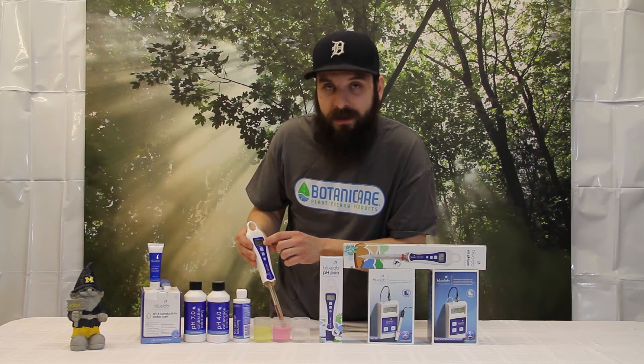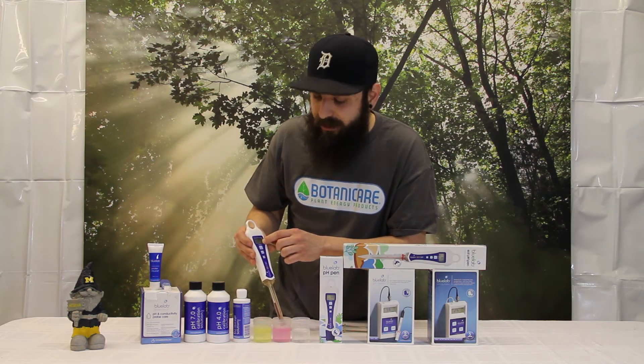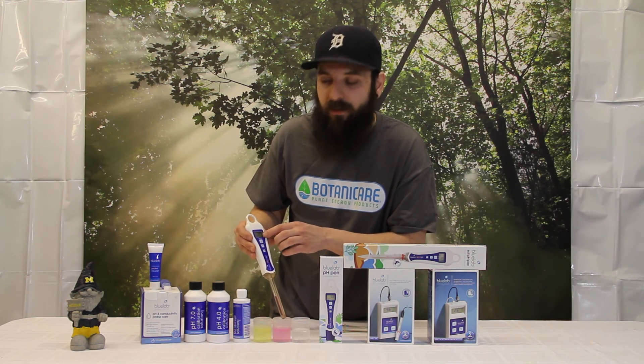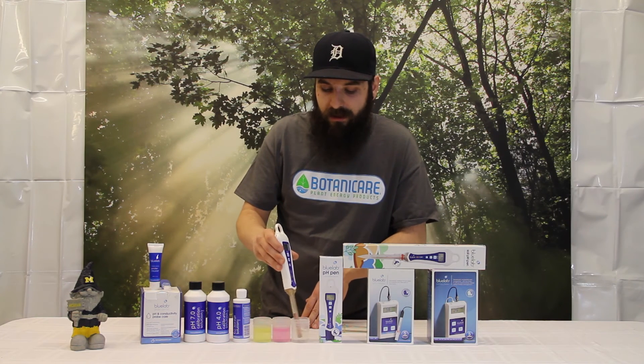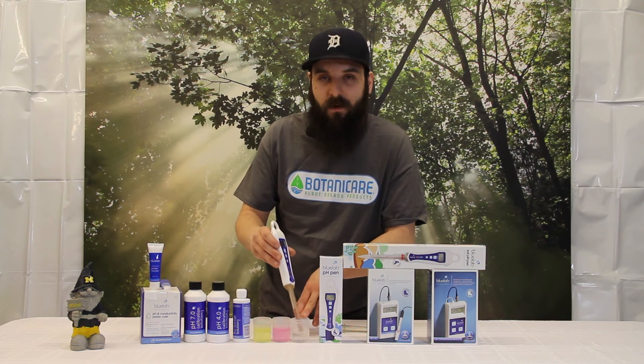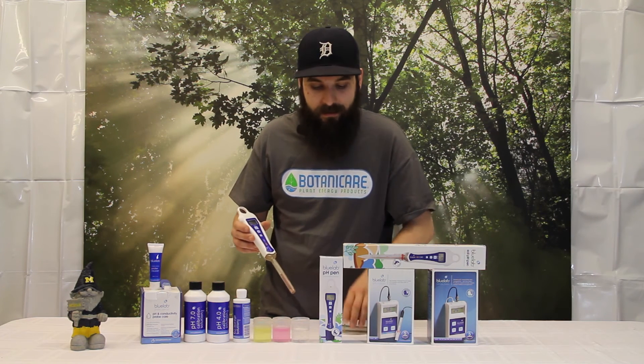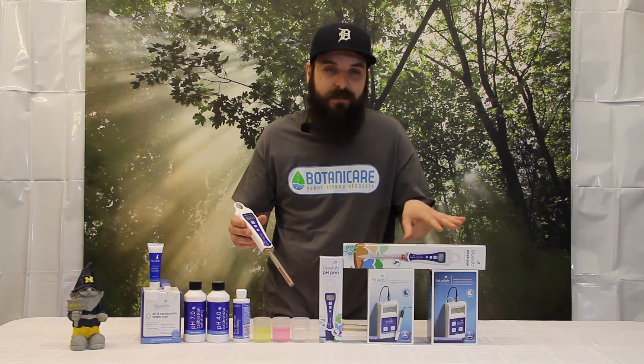And this little check mark will pop up on here. Until that check mark goes away, you'll be getting accurate readings — and that's also letting you know that you've had a successful calibration. Keep the probe clean and store it in either tap water, spring water, or their storage solution. The same process applies for all of these pH pens and probes.